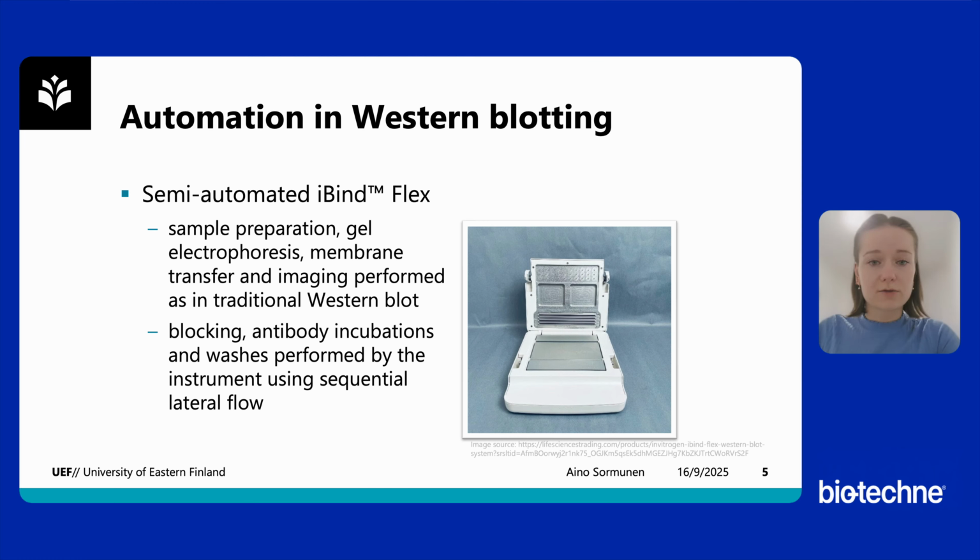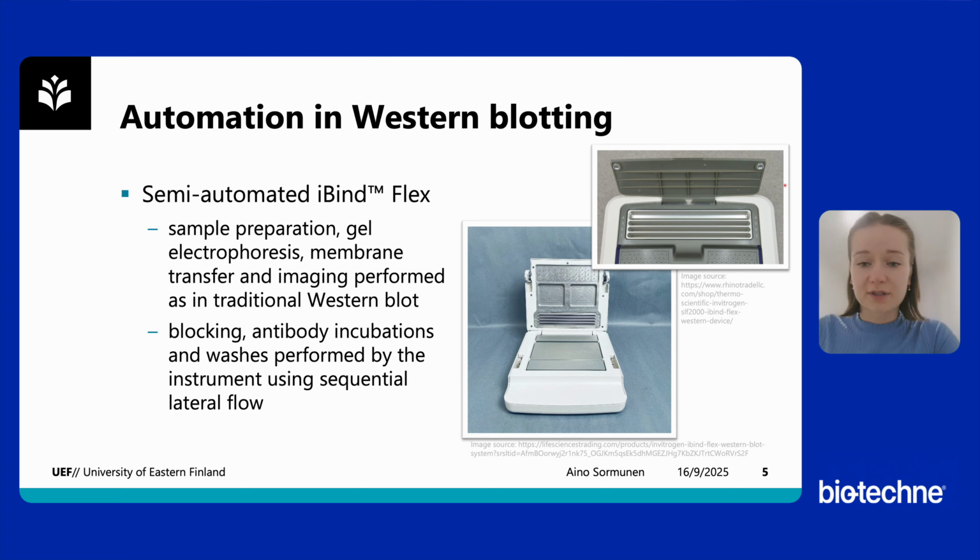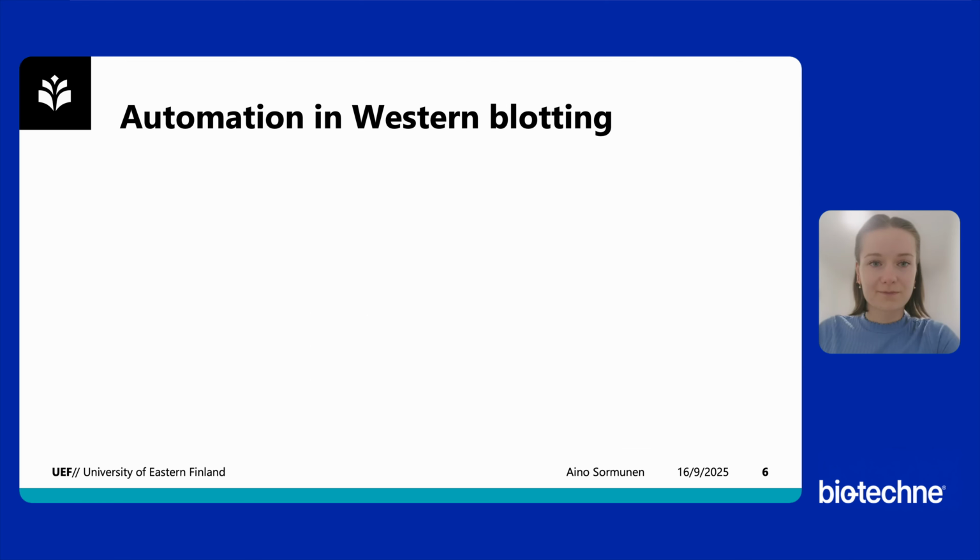This is what the device looks like. So basically you put your membrane here in the center, you close the lid, and then on top of the device there's another lid that opens, and here you can pipette your blocking solutions, antibody solutions, and washing solutions. You close everything and then you just let it run for 2.5 hours on its own. And after that, you can proceed as normal into the imaging steps.